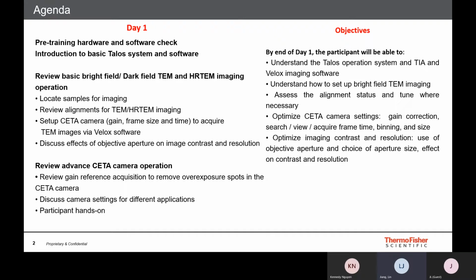Also this afternoon we're going to do high resolution TEM imaging. We're also going to review how to align the Ceta camera, and how to calibrate the Ceta camera to remove any artifacts. By the end of today, I hope you will understand the basic Talos operating system, know how to use the TIA software and Velox image software, and understand how to set up bright field TEM imaging.